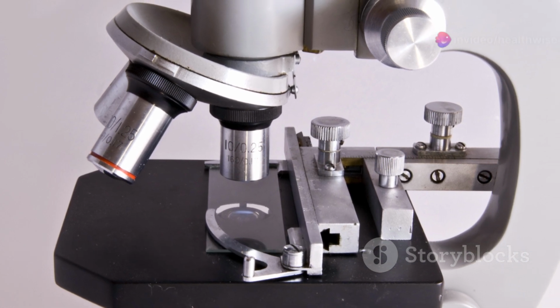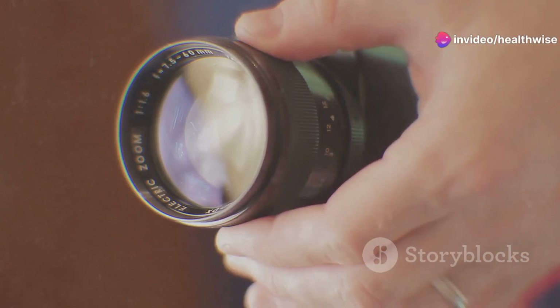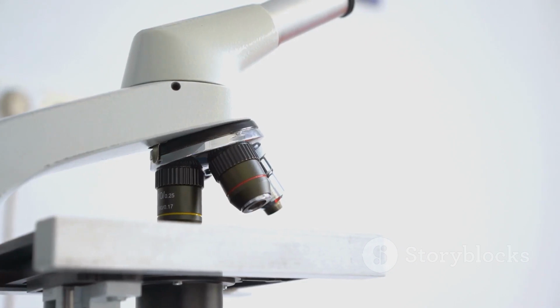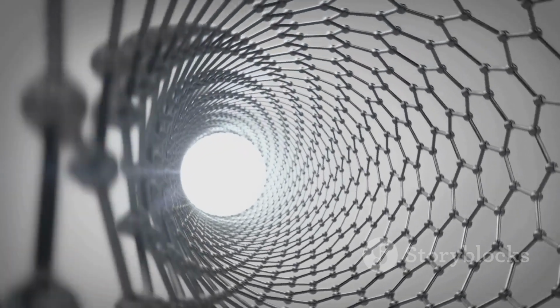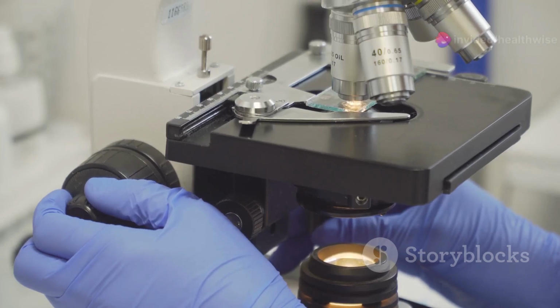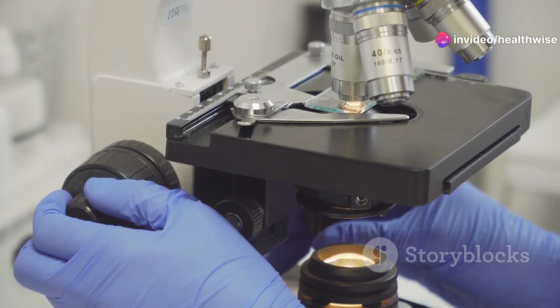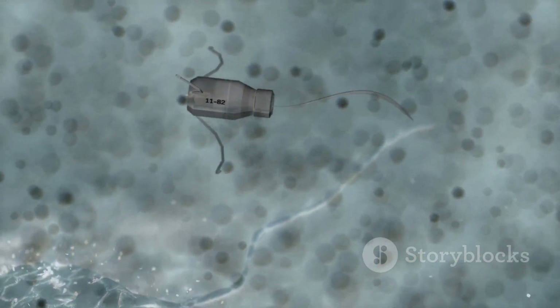Light microscopes have limitations. They can only magnify objects up to a certain point. To see even smaller structures, we need to turn to a different kind of illumination: electrons. Electrons have a much shorter wavelength than light. This allows electron microscopes to achieve far greater resolution and magnification than light microscopes. We can now visualize objects thousands of times smaller than a human hair.